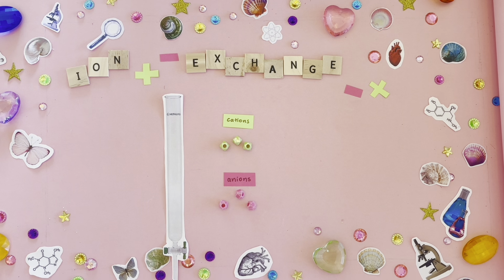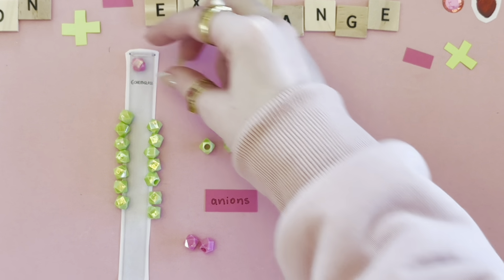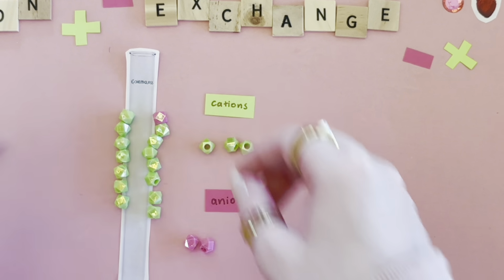Ion exchange chromatography separates molecules based on their overall charge at a given pH. The resin inside the column carries charged groups, either positive or negative, and proteins with the opposite charge will stick to it more strongly. When you load a protein mixture onto the column, some proteins bind tightly, some bind weakly, and some don't bind at all, depending on their charge.